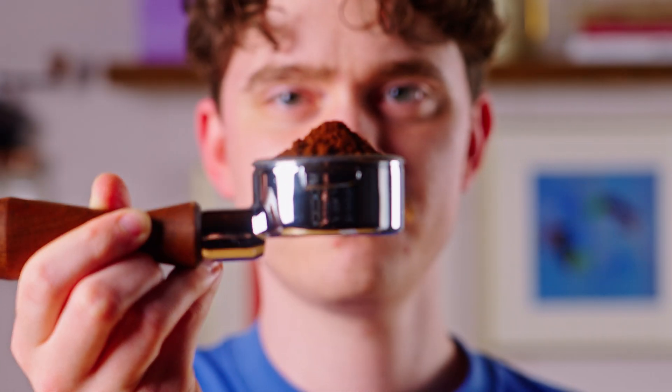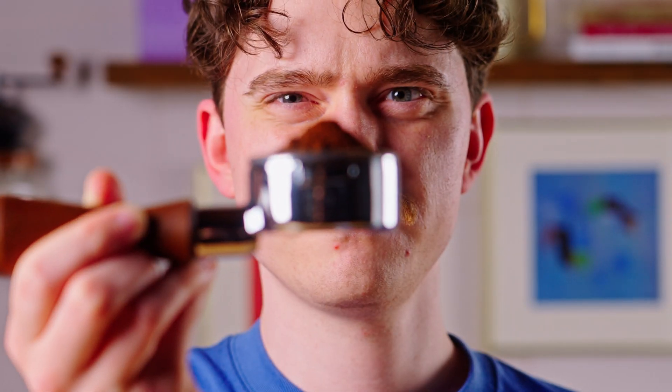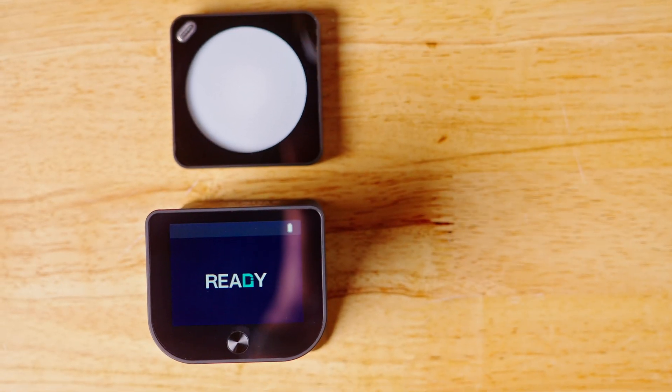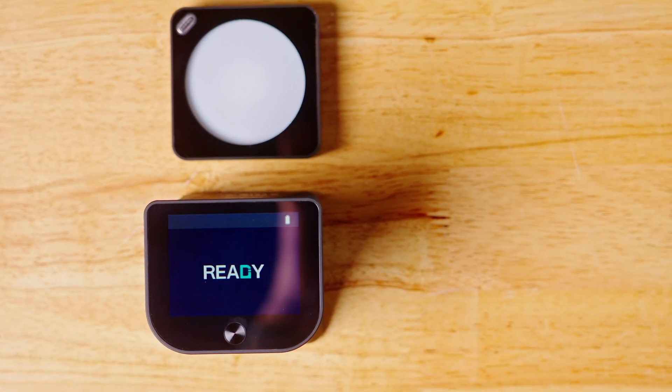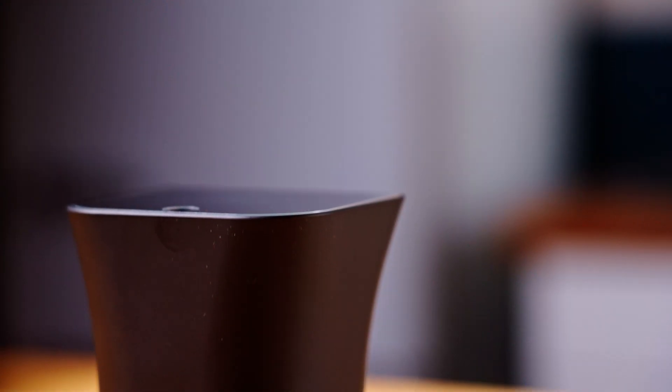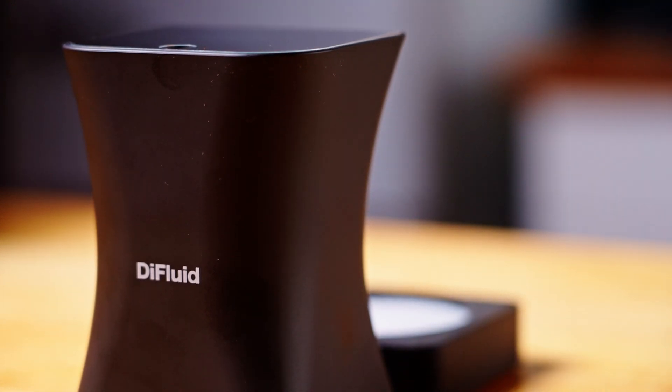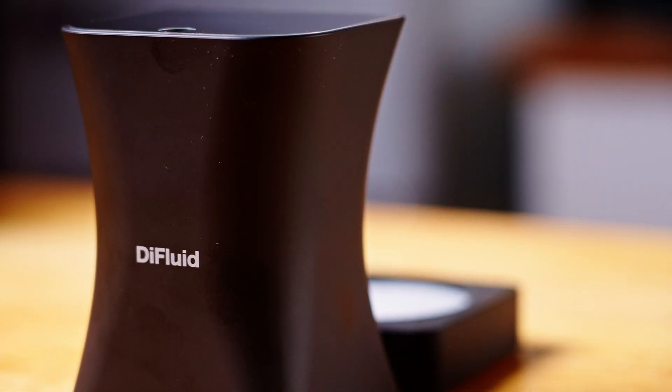Today, we'll ignore our pitiful organic eyes and use this fancy particle size analyzer to get an impression of how different grinders, settings, and even coffees can affect your particle size distribution, and how it affects your coffee.